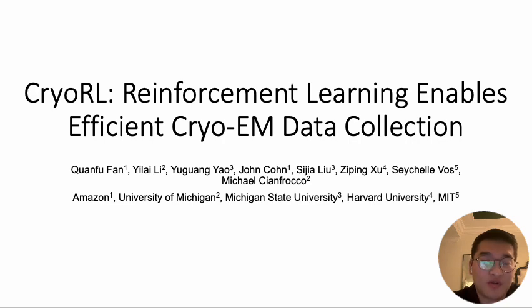In this video, I'm going to introduce our paper entitled CryoRL: Reinforcement Learning Enables Efficient Cryo-EM Data Collection. Our team is from Amazon, University of Michigan, Michigan State University, Harvard University, and MIT.